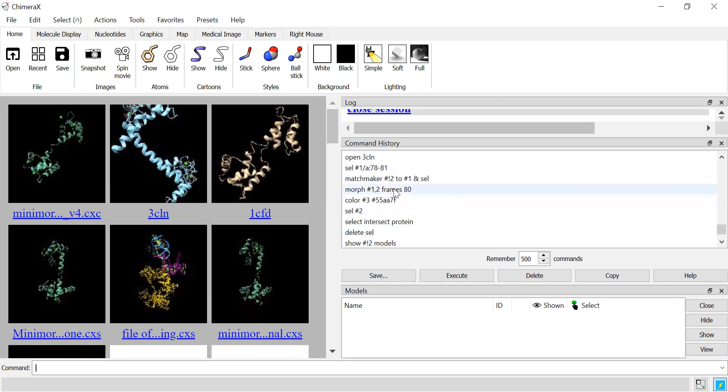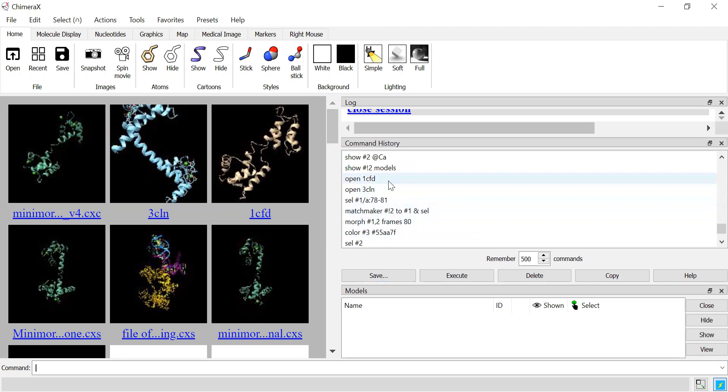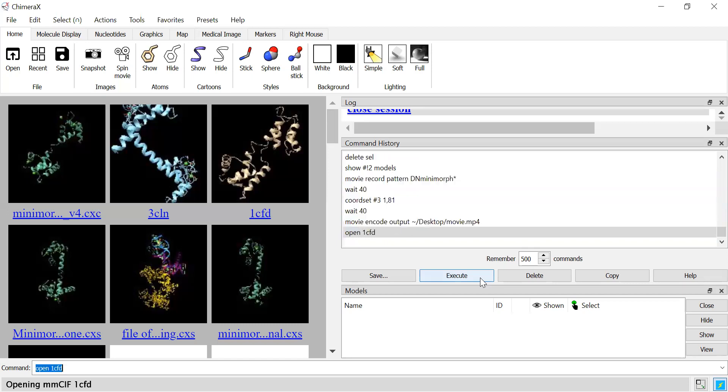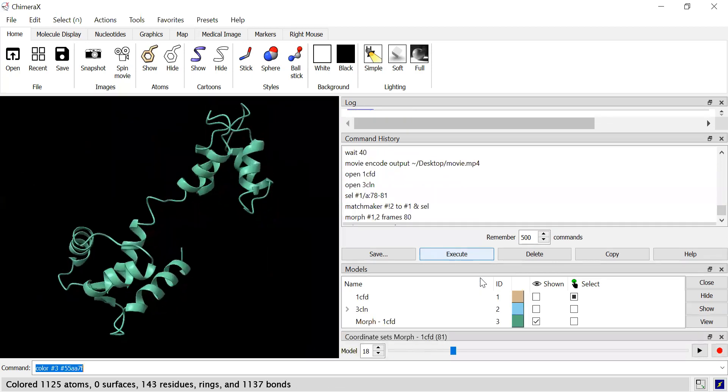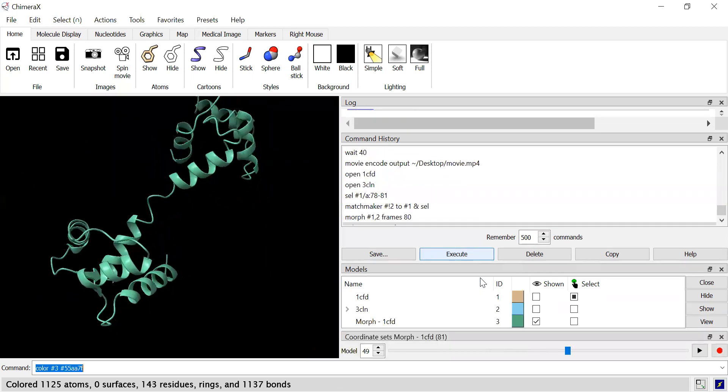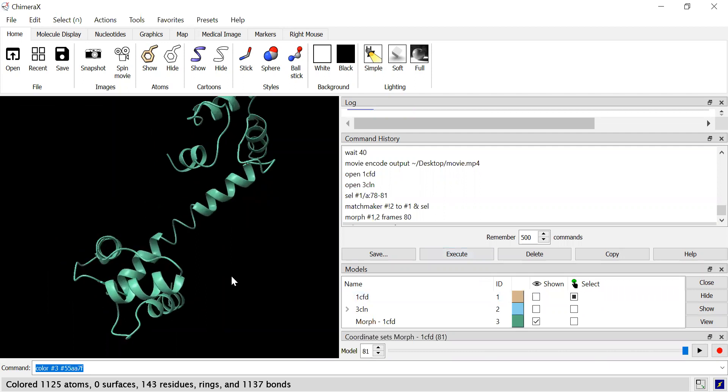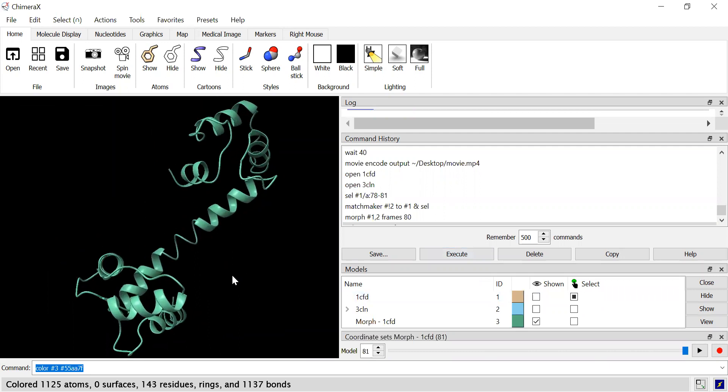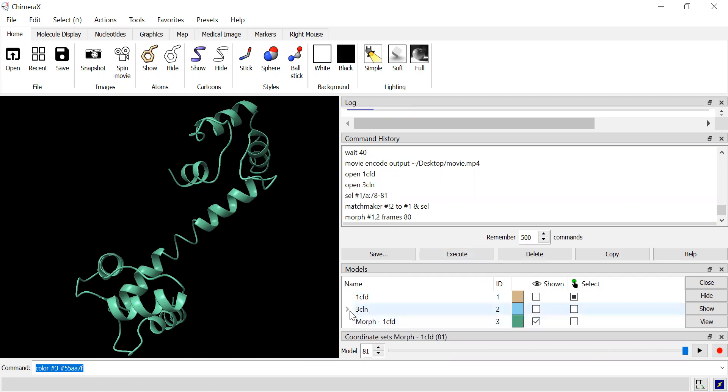So let me pull this up. All right, let me execute that. Great. So this is very useful if you've created a morph. But if you say you want to show the ligands that are causing the changing conformation here. Now the morph is its own separate figure. And one of the best ways is to just delete a good part of this original figure after you've created the morph.